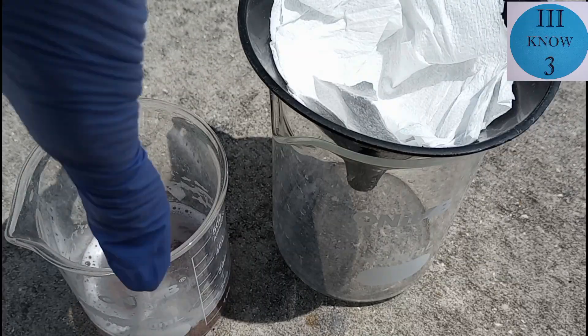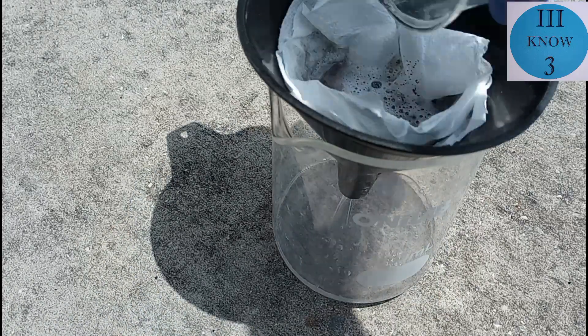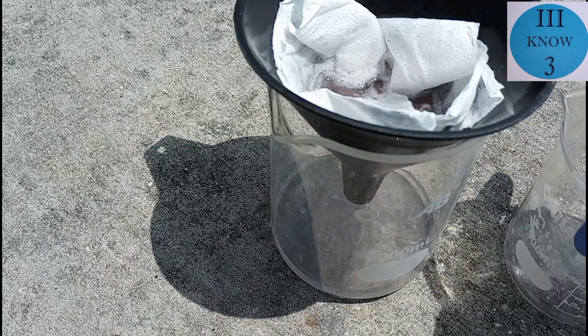From letting it sit overnight it looked like nothing had happened. The aluminum basically passivated in the zinc chloride solution. So I'm going to let this zinc chloride solution evaporate, and if I can get some crystals to grow I will make an update.